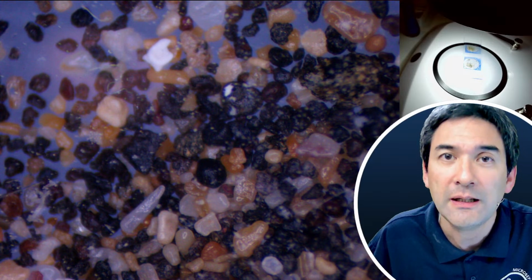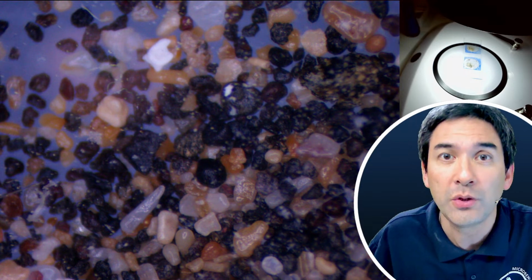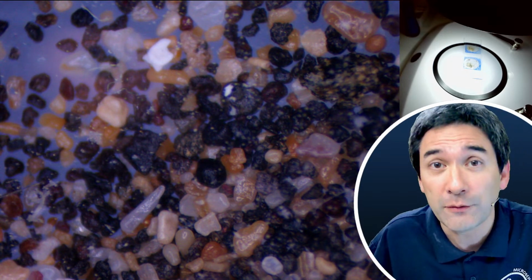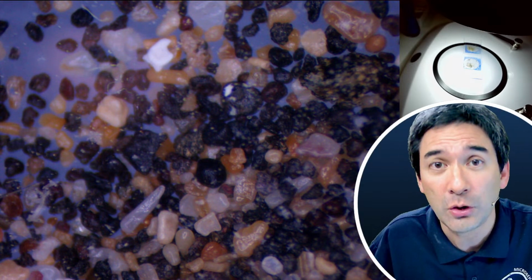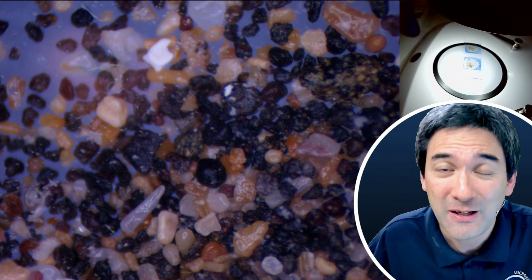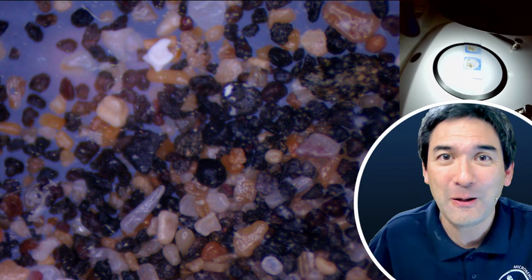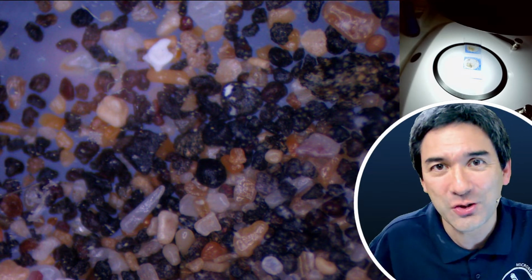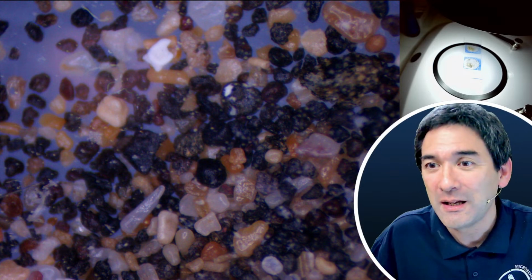70% alcohol is the standard concentration of alcohol that we use in the microbiology lab for disinfecting surfaces. As a matter of fact, a higher or a lower concentration of alcohol reduces the effect of disinfection. Interestingly, even if you go up with the concentration of alcohol, the effect is not quite as high. The reason is that 70% alcohol is just the right concentration to dissolve the cell membranes.